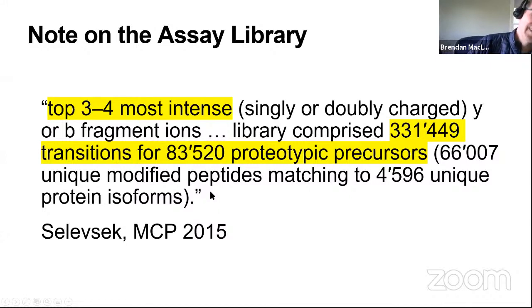We're going to look at today what the difference is between making your numbers really big and just running everything through and then going to a tool like MSstats and saying, okay, you tell me what's different. My assertion is that ends up giving MSstats really noisy data. Statistics are meant to find signal in noise, but the noisier the data, the more difficult the job they have, and the less likely they are to come out with something useful for you.